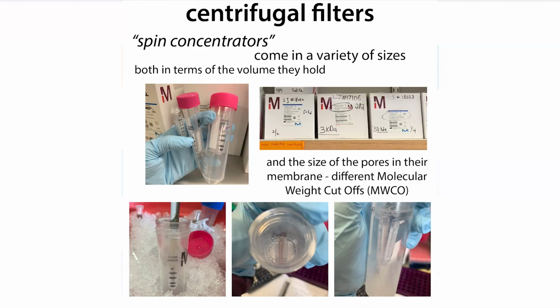Also, some people do a buffer exchange with the protein concentrator. So something like an Amicon spin filter, ultrafiltration device. I talk a lot more about those in another post. But something to be careful of with that is then you're increasing the concentration. And as we talked about, concentration can tend to make the proteins aggregate more and therefore increase the risk of precipitating out.